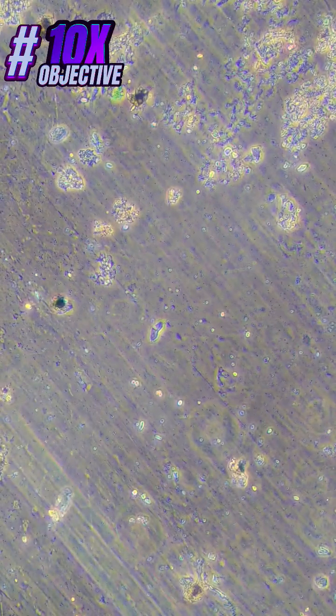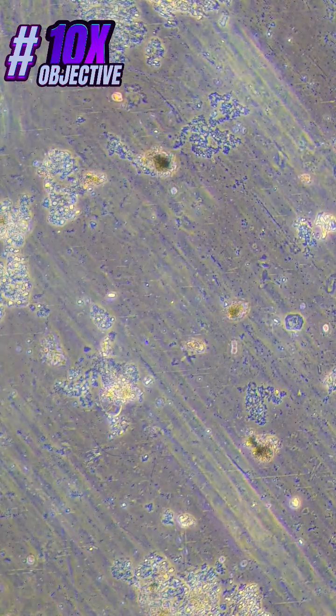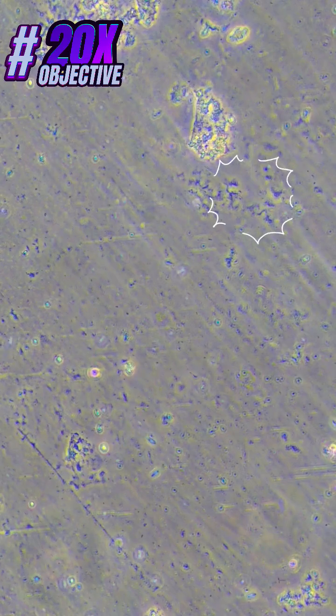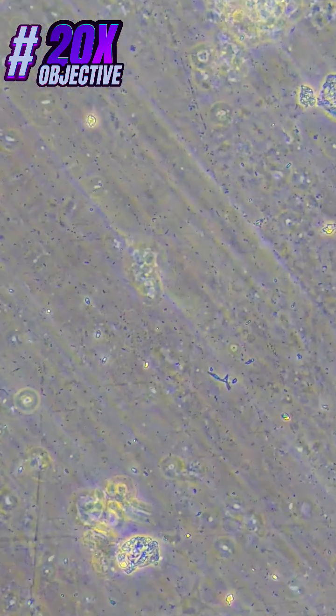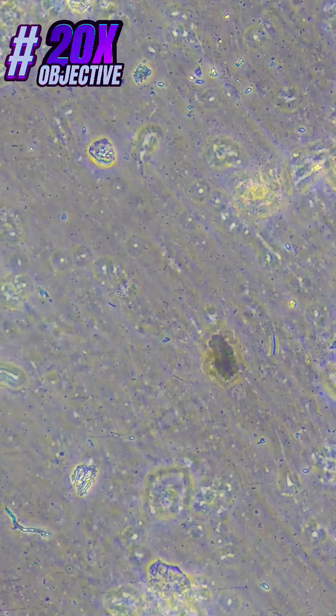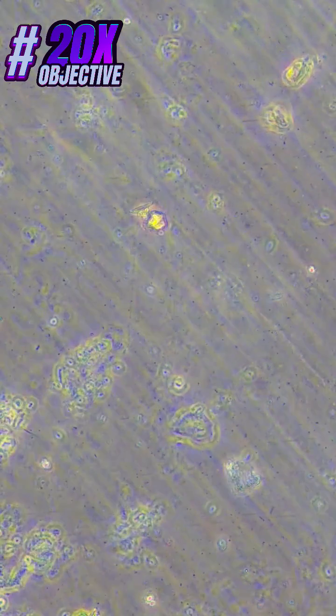These results are observed under 10x phase objective. And these are observed under 20x objective, which gives the total magnification of 200x. In this, you can see many tiny microorganisms in a single drop of pond water moving around.